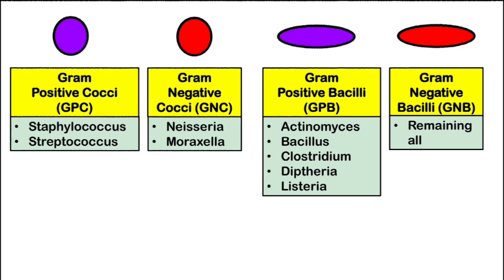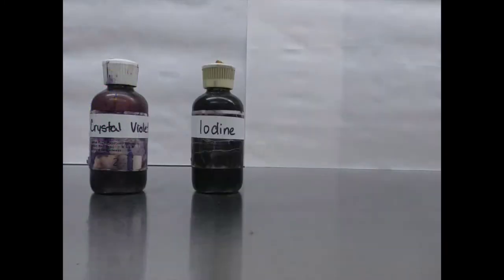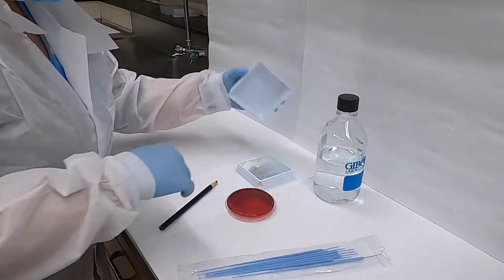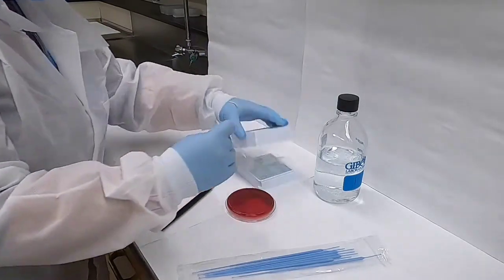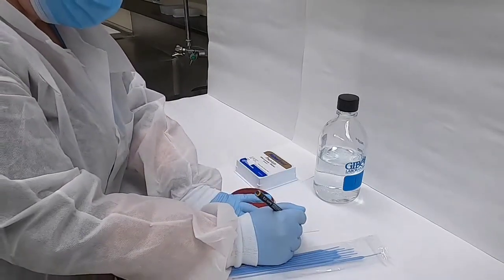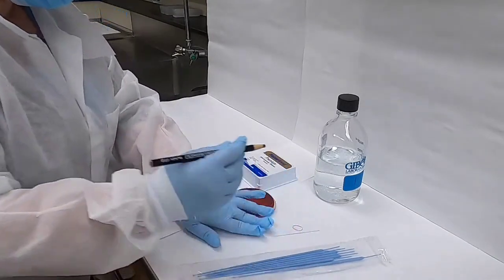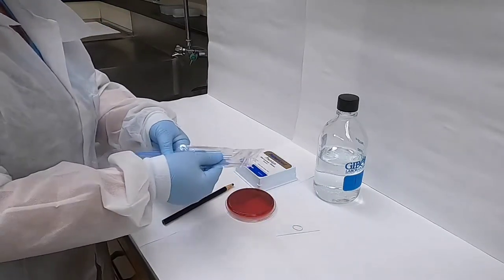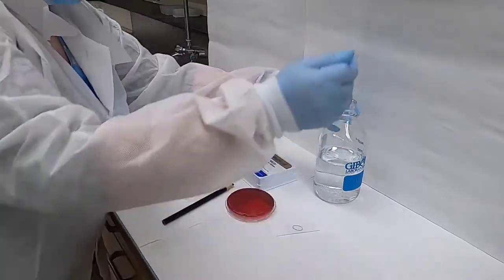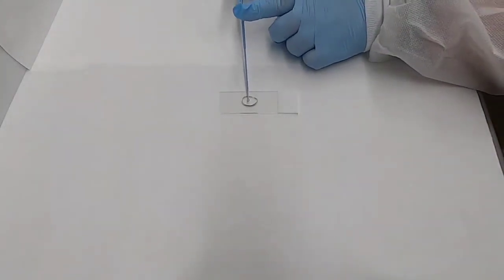We will now see the demonstration. Basic reagents required for a Gram stain: crystal violet and Gram's iodine for the primary stain, acetone for decolorization, and basic fuchsin or safranin for the secondary stain. The first step is to prepare the glass slide — remember to place your slide frosted side up. Draw a circle on the slide using a grease pencil, which helps contain the materials and orient yourself when visualizing under a microscope.